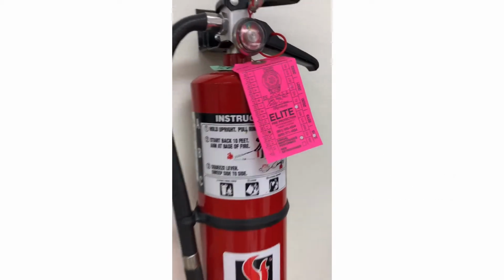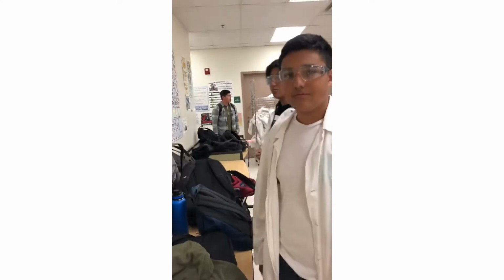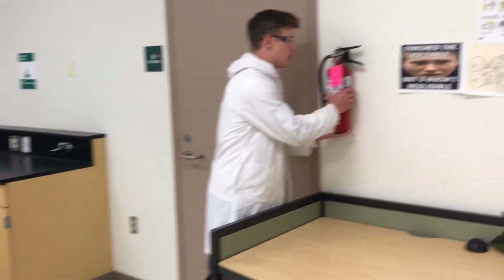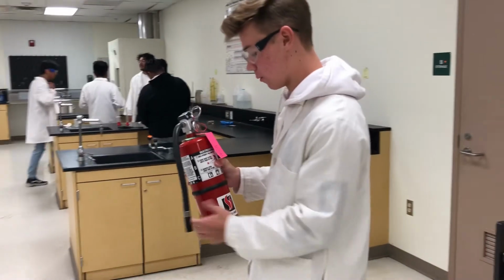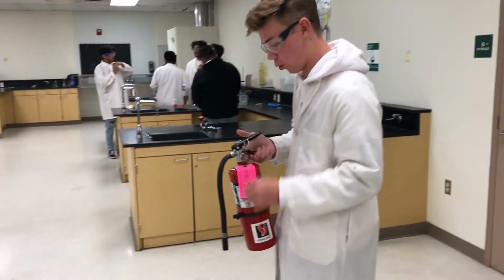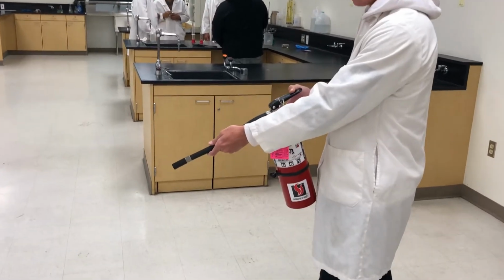Always know the location of the fire extinguisher. Make sure the pressure is okay. It is right next to the backpack table. Remove the fire extinguisher from the wall, take out the nozzle, and from around 10 feet away, pull the pin, aim at a 45 degree angle at the base, and press.